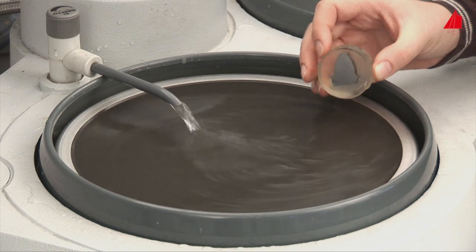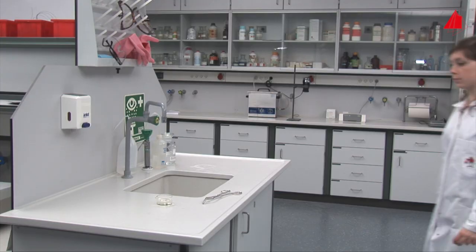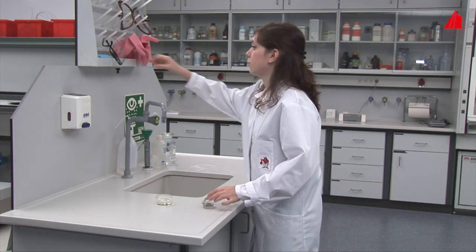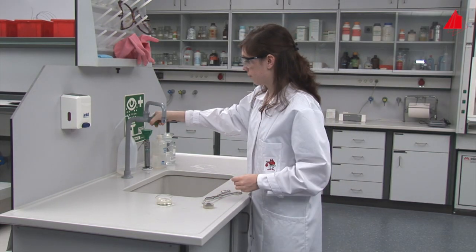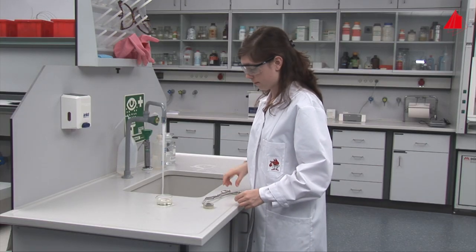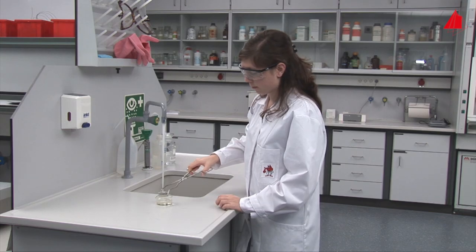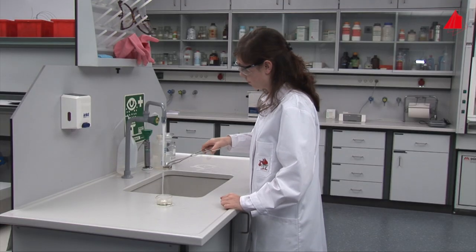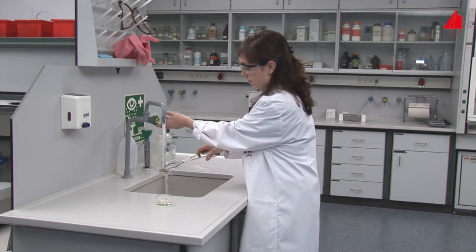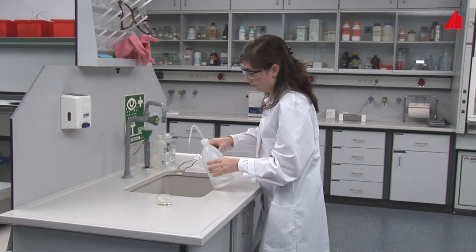As before, the internal structure will only be revealed by etching. But now the material tester uses a different etchant. This time it is nitric acid diluted in ethanol. She holds the mounted sample with pliers and immerses it into the etchant. After a few seconds, she takes the sample out again, washes it thoroughly with water, then with alcohol and finally dries it with a hairdryer.